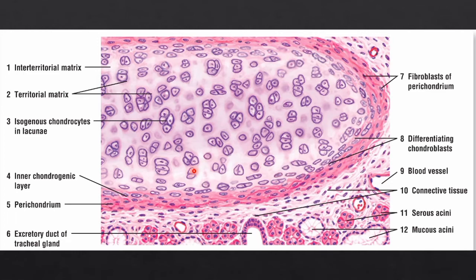Other features, you might have studied. A simple identification is that it is lined by the perichondrium. Then the matrix appears blue in color, and the chondrocytes appear like eyes. The chondrocytes are present in groups, and the groups are called cell nests.